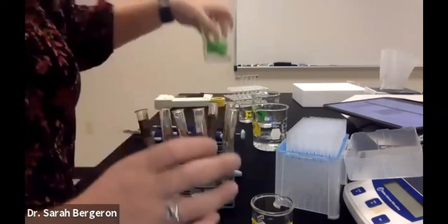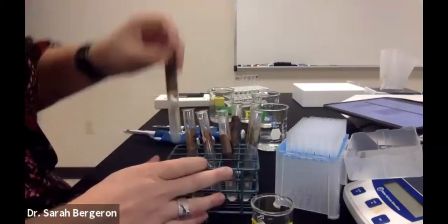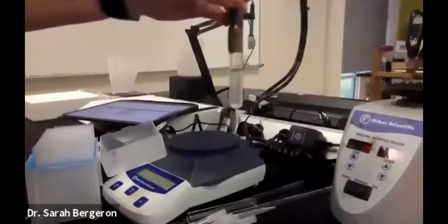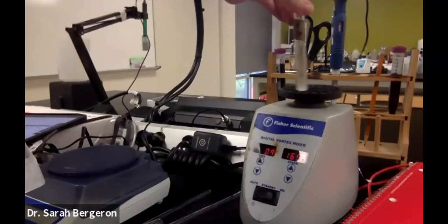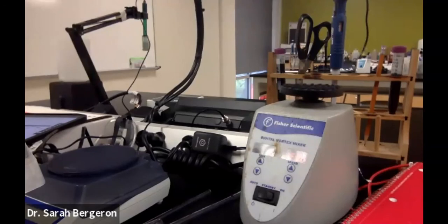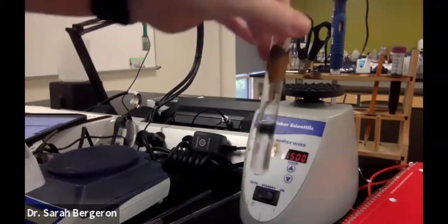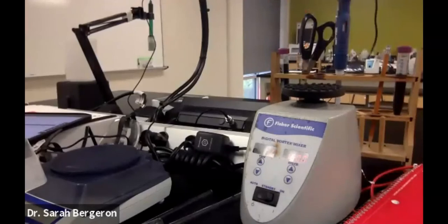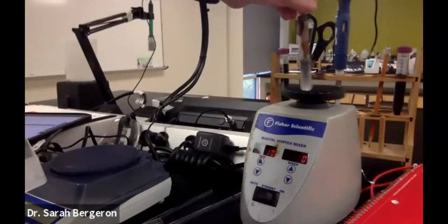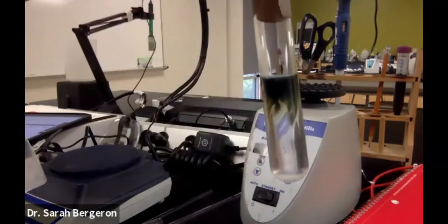All right. So we had our samples, we put our water, we put ascorbic acid, we put ammonium molybdate. So now what we need to do is mix them, and then, I guess I need to turn this down, and then we are going to check the absorbance. Oh, and some of these you can already see. Can you see that? You see the difference? This one, so you can see there's another one that's got a nice difference already.